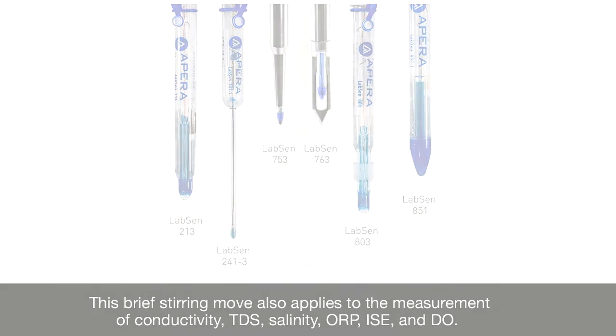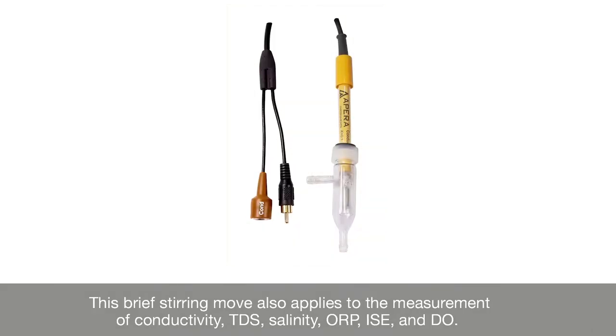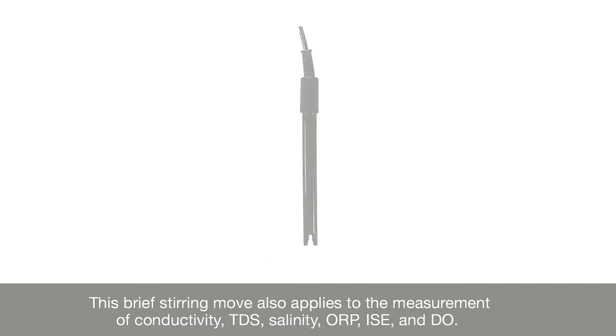This brief stirring move also applies to the measurement of conductivity, TDS, salinity, ORP, ISE, and DO.